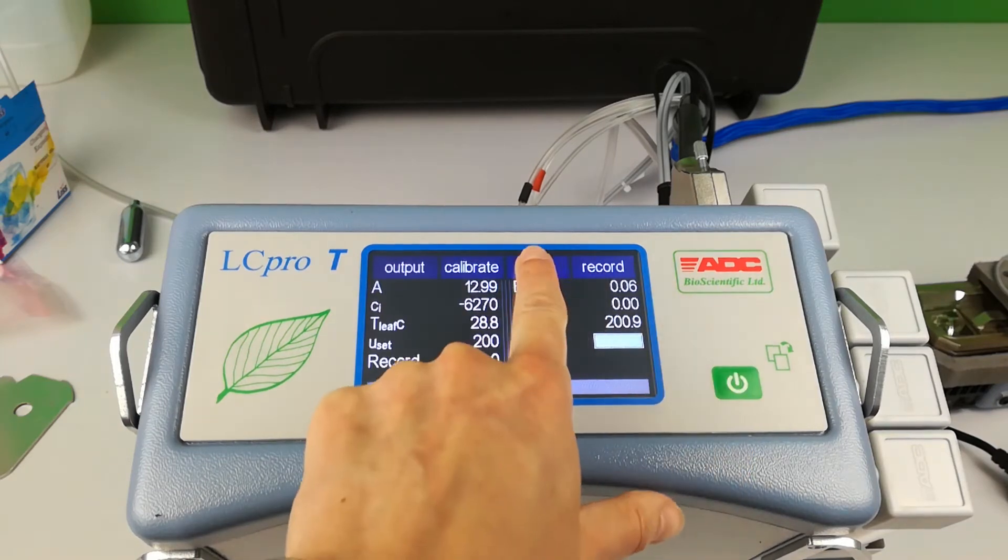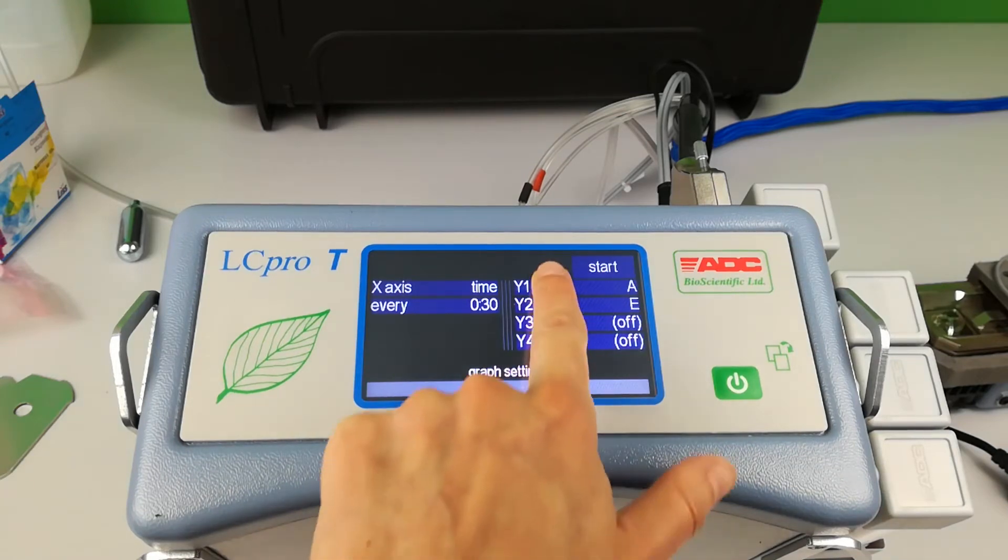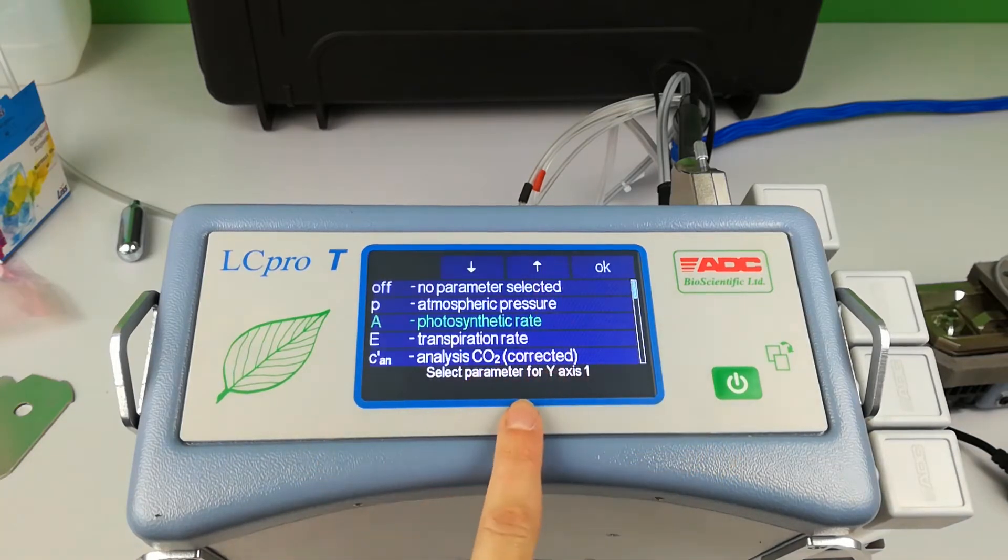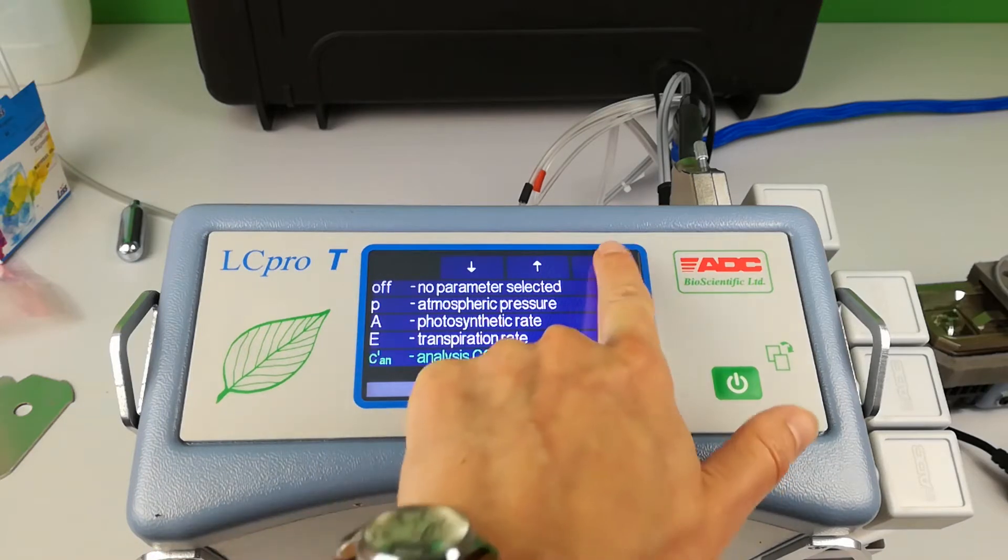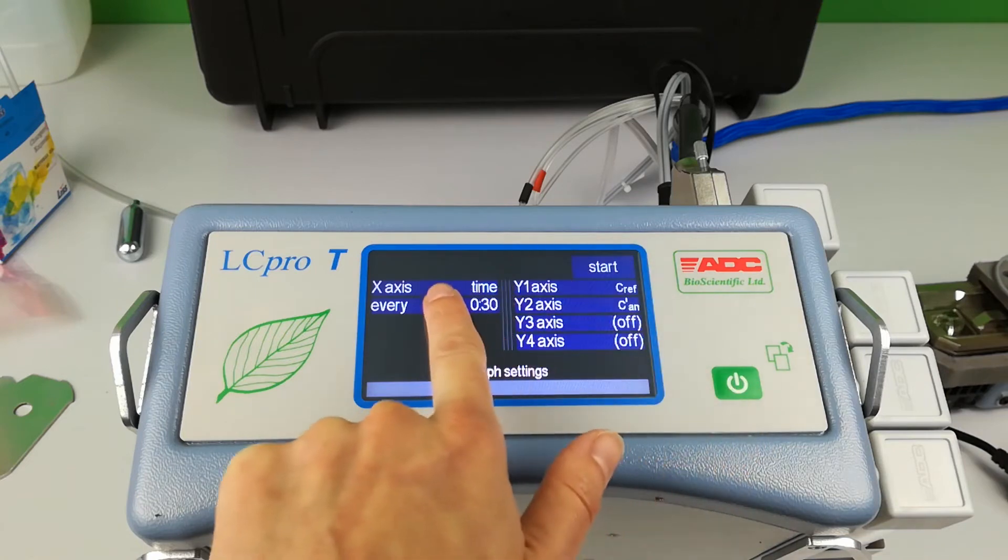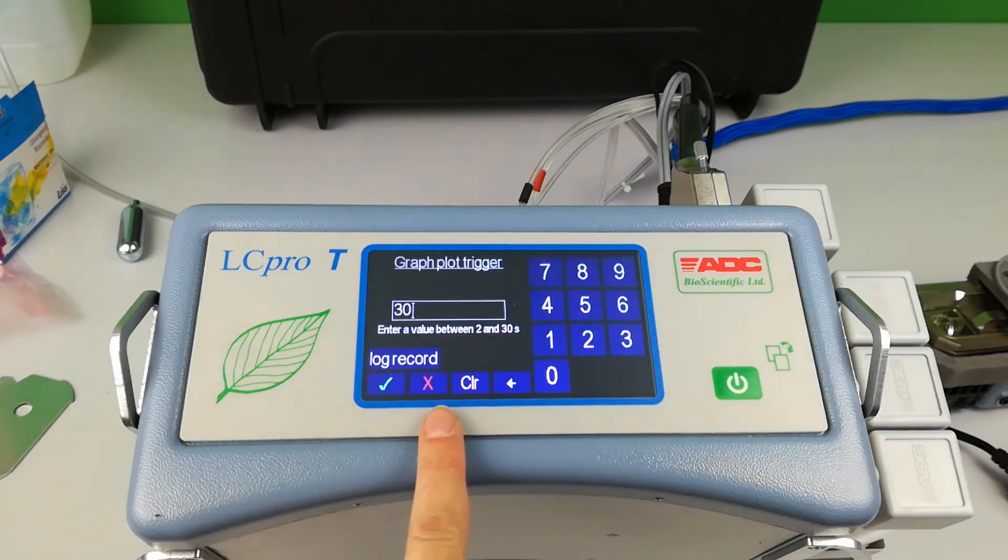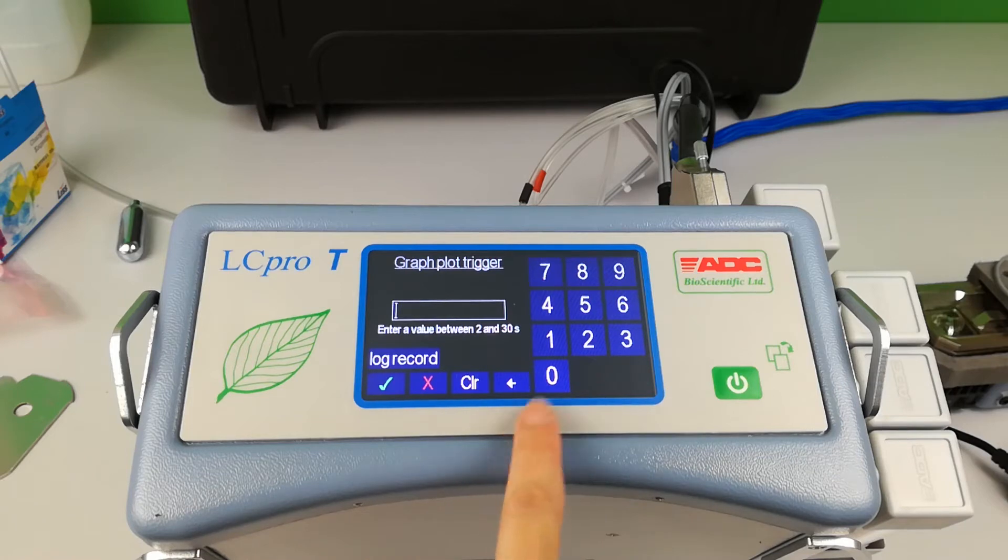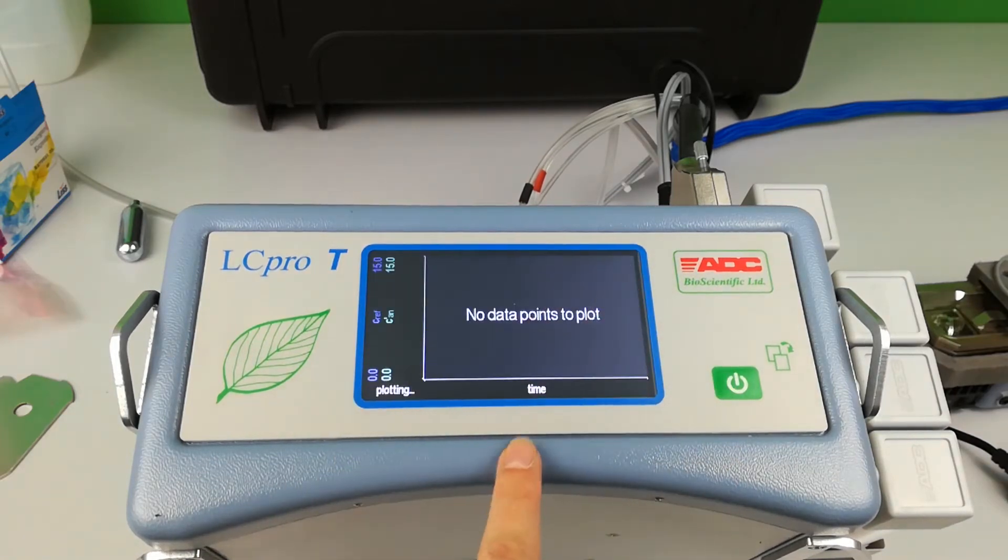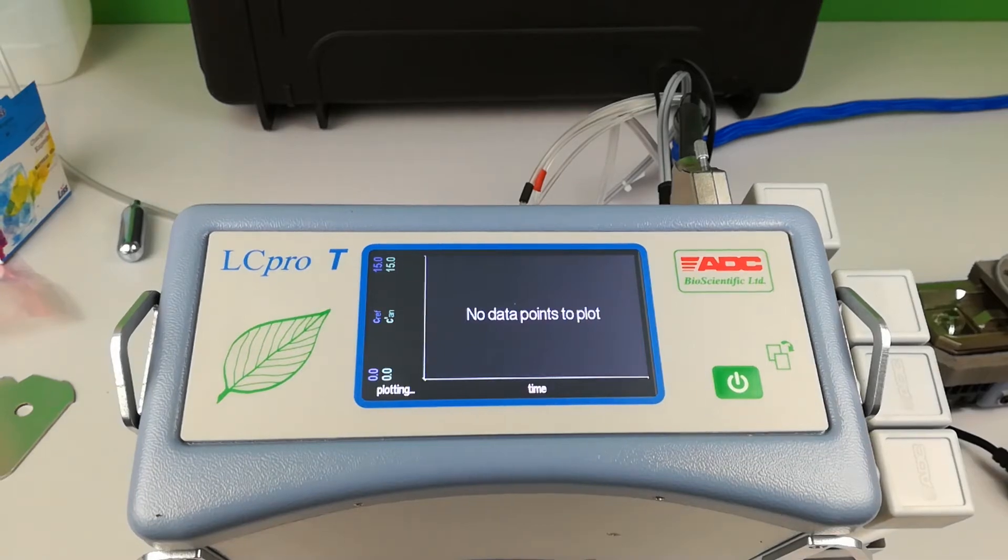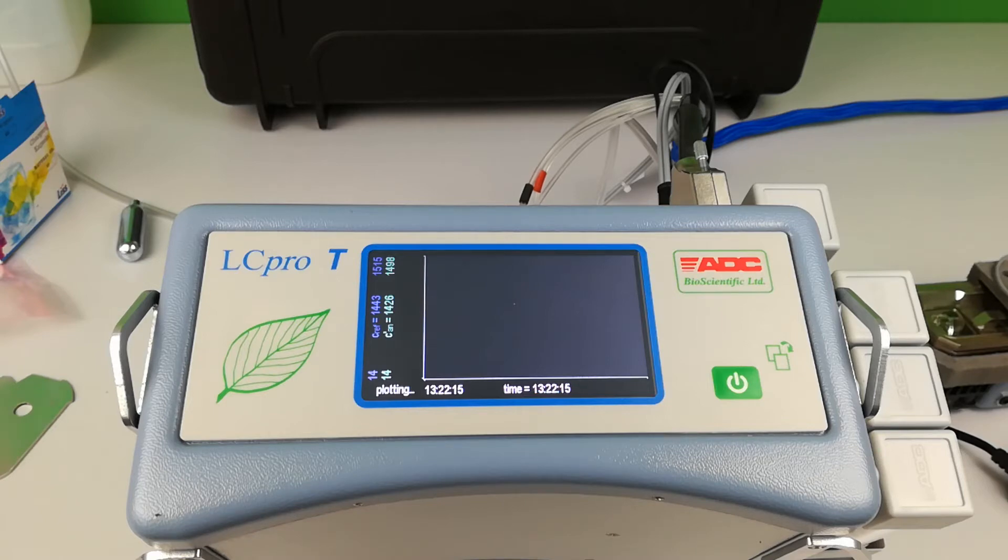Here you can select the X and Y axes. Up to 4 legends can be selected on the Y axis. The graph will be plotted anywhere between every 2 and 30 seconds or every log record, which means a data point is only taken when you record a data point, either manually or, as we will see later on, using a sequence file. Here you can monitor the C ref, which is now approaching the set value of 1500 in this example.